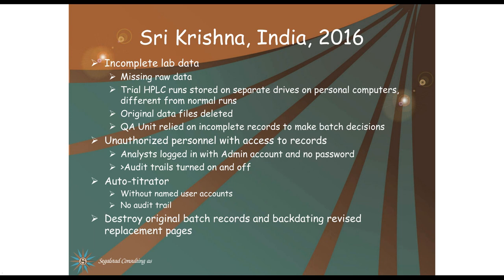Another one from India: incomplete lab data, missing raw data. Trial HPLC runs were stored on separate drives on personal computers, different from the normal runs. Original data files were deleted. The QA unit relied on incomplete records to make batch decisions.